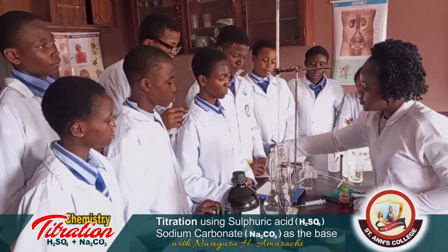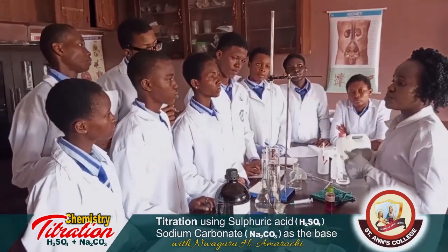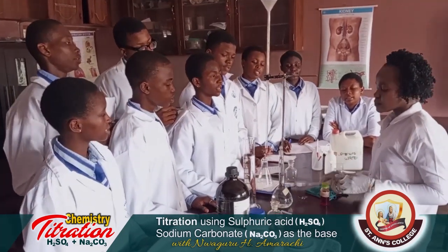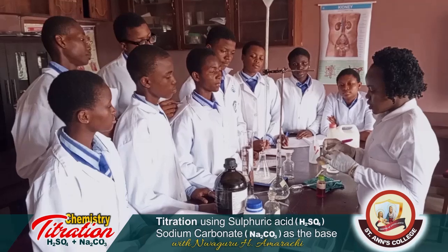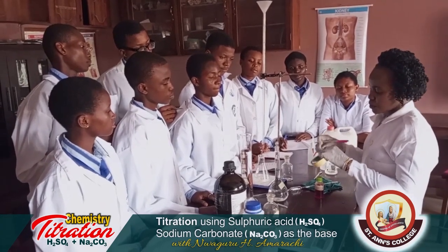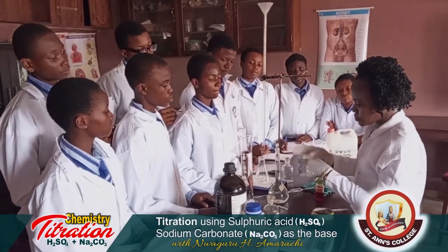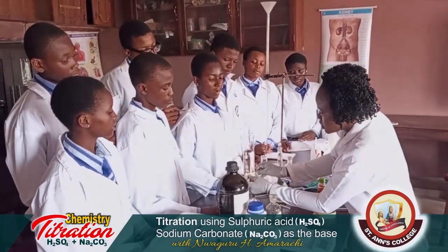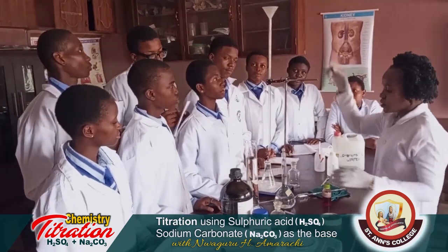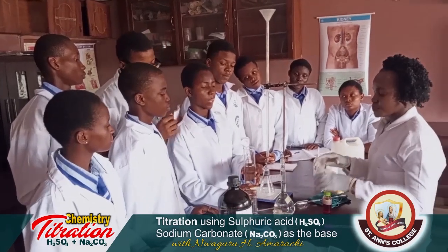Now the titration proper. This is our burette, and what's supposed to be inside the burette? The acid. Then the pipette, the base. Now we have to put down a label showing that this is what? An acid. Acid. Okay. Now add the acid to the burette.